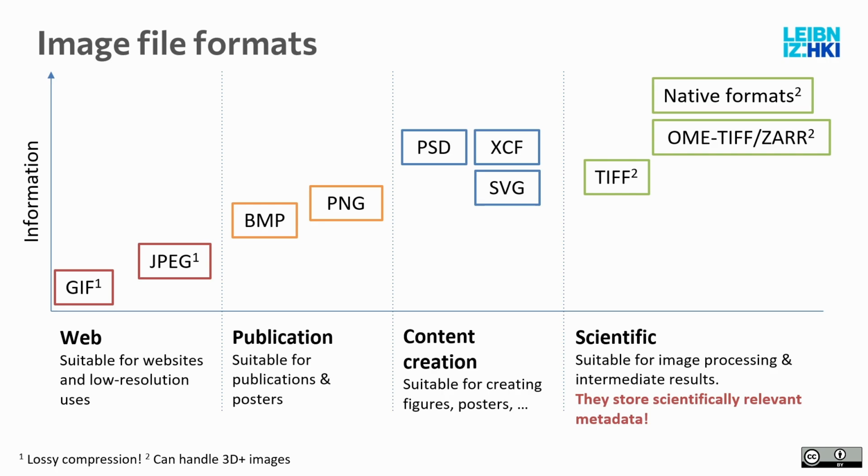Then you have it going a step down, but not too much. These international standardized formats, OME-TIFF and OME-Zarr, although OME-Zarr is quite new. These are basically made by people who work directly together with the microscope manufacturers so that all their metadata is carried over into this format. So it's also a valid way.